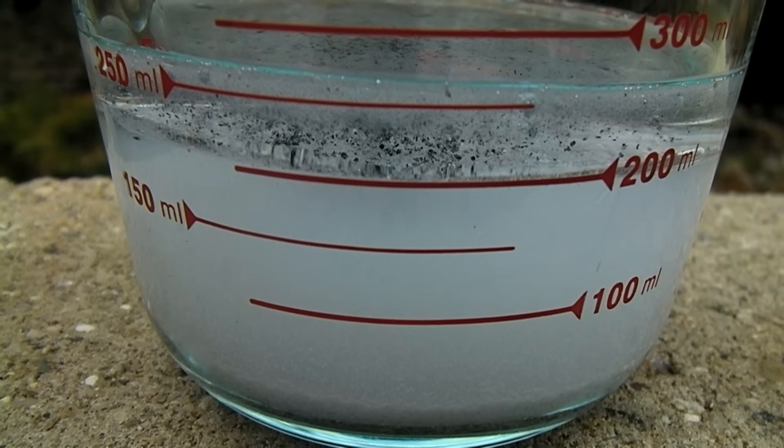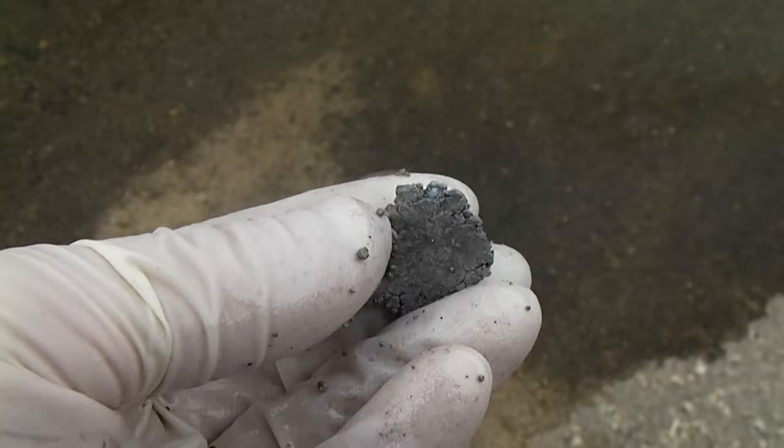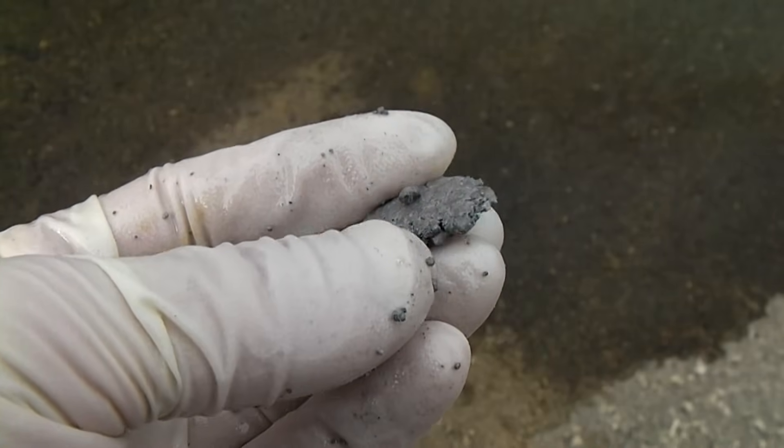The sodium can then be stored under mineral oil until it is ready for use. Sodium metal is extremely soft at room temperature, so it's easy to take many of the small pieces and press them into one piece.